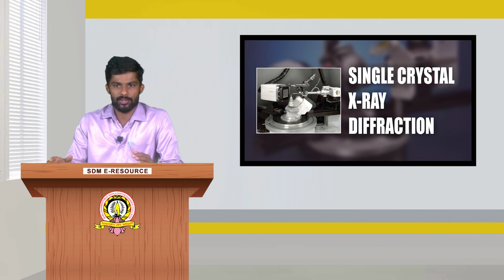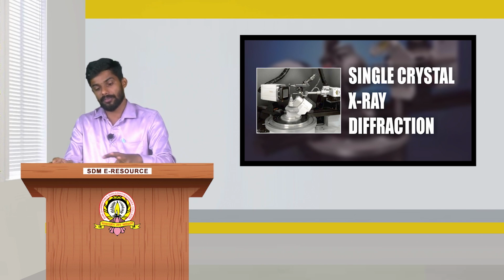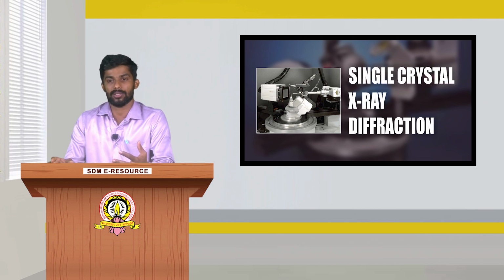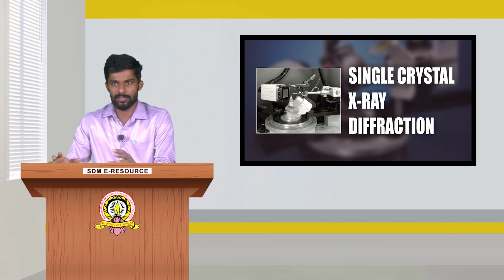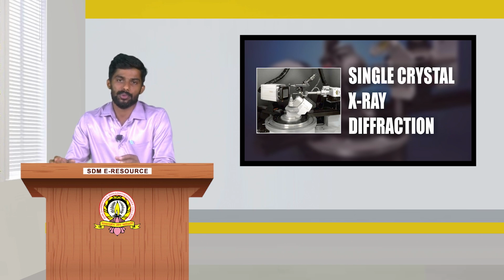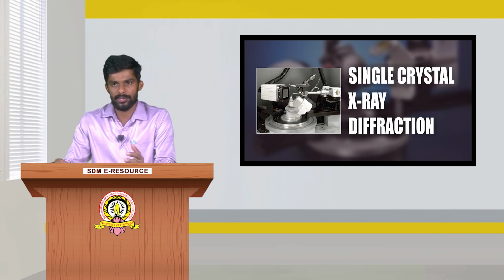So in the host computer, not only is the raw data processed, it is also used to control the instrument, the various rotations in the goniometer and the sample placement. All this can be monitored using the host computer. And now let us look at the advantages of this method.